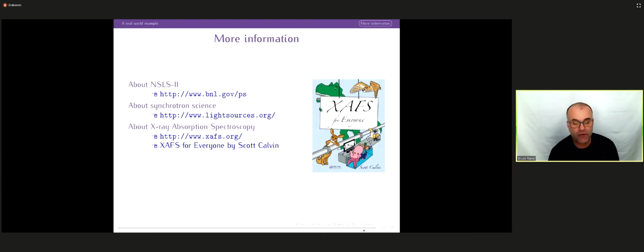In principle, yes. In practice, it is a problem of active study. So the calculations are very, very challenging, and they are just starting to get to be good enough to do what you are asking about. They're pretty expert-only calculations. They're not yet broadly available. So doing those kinds of XANES calculations is challenging.